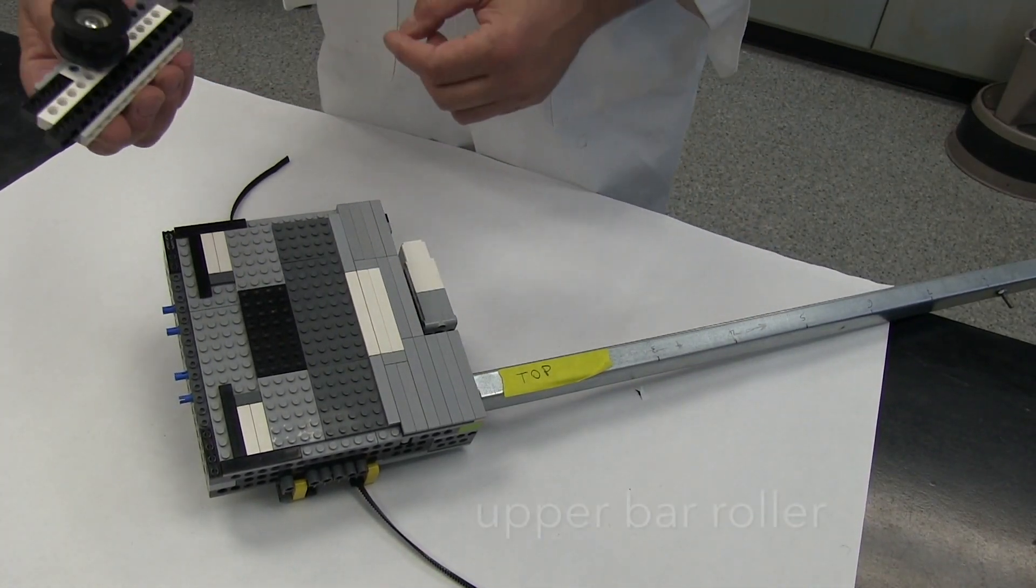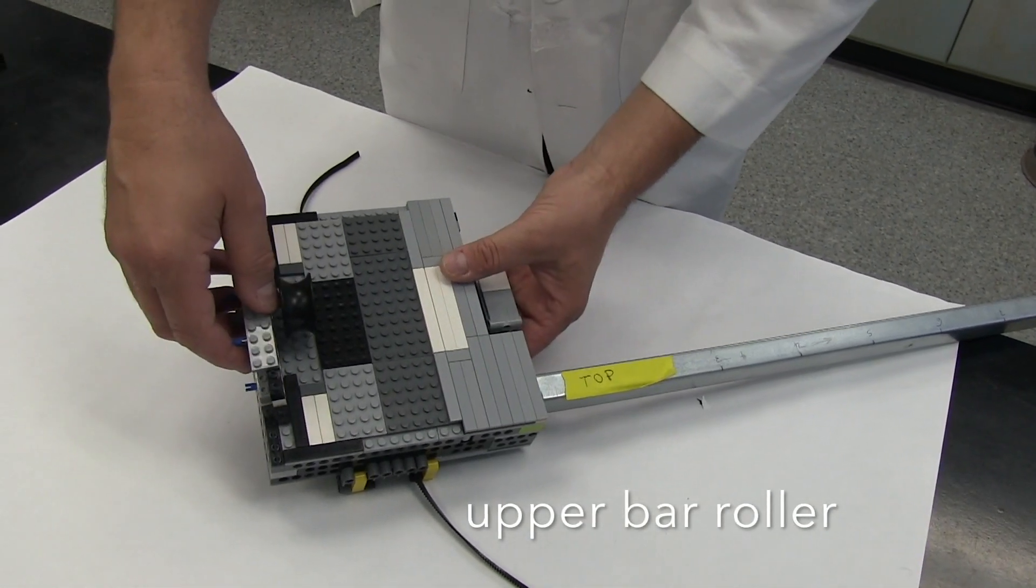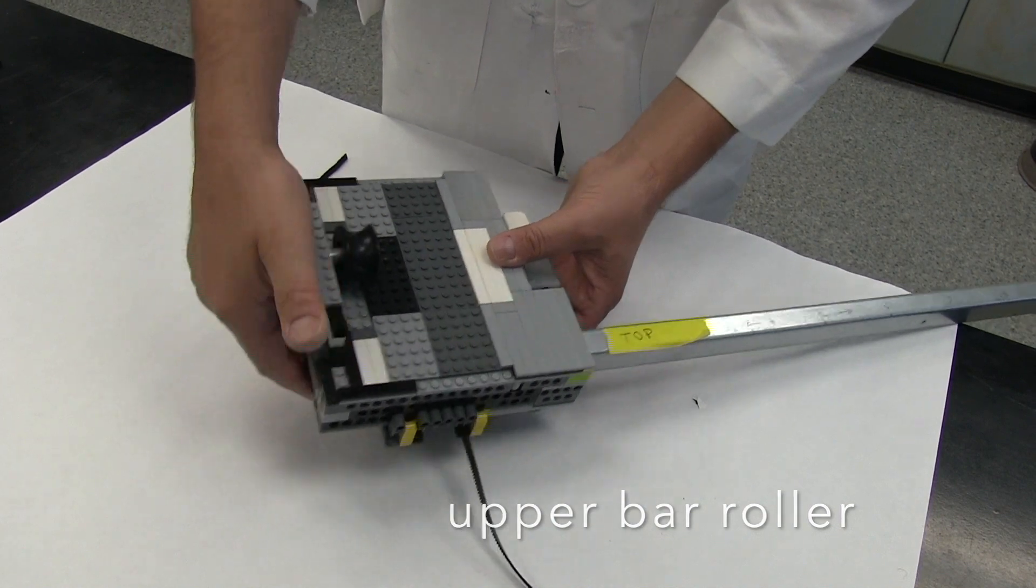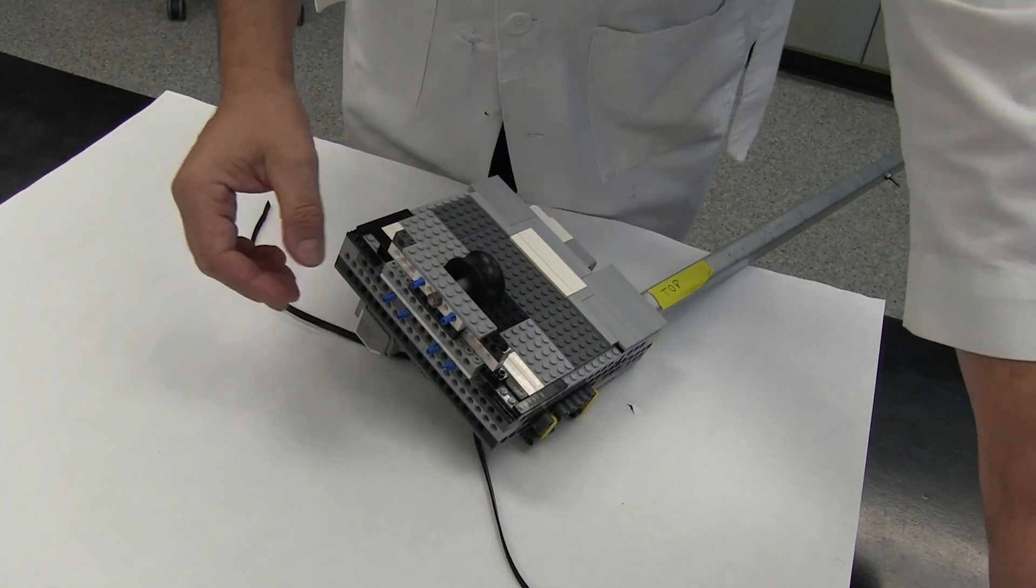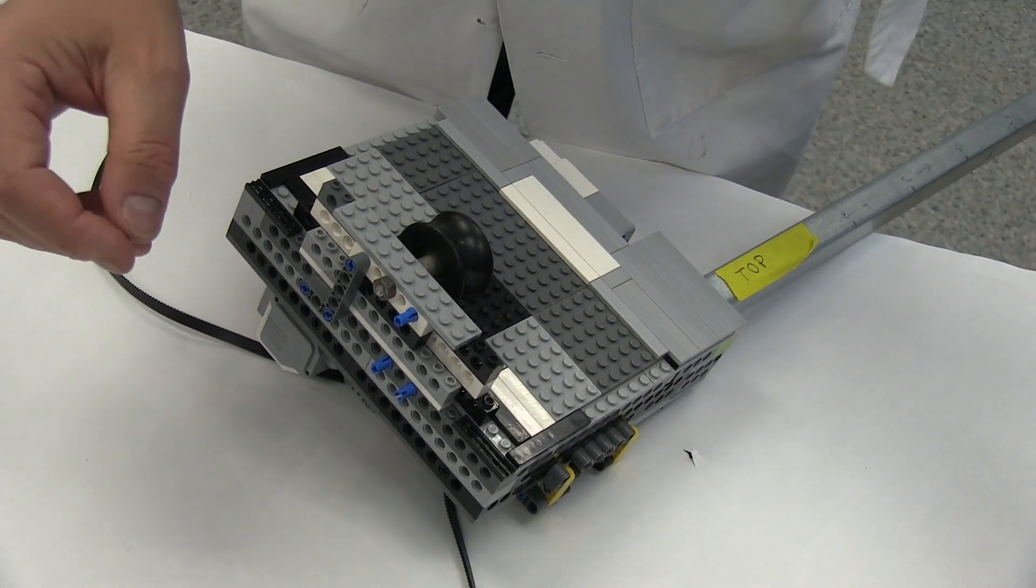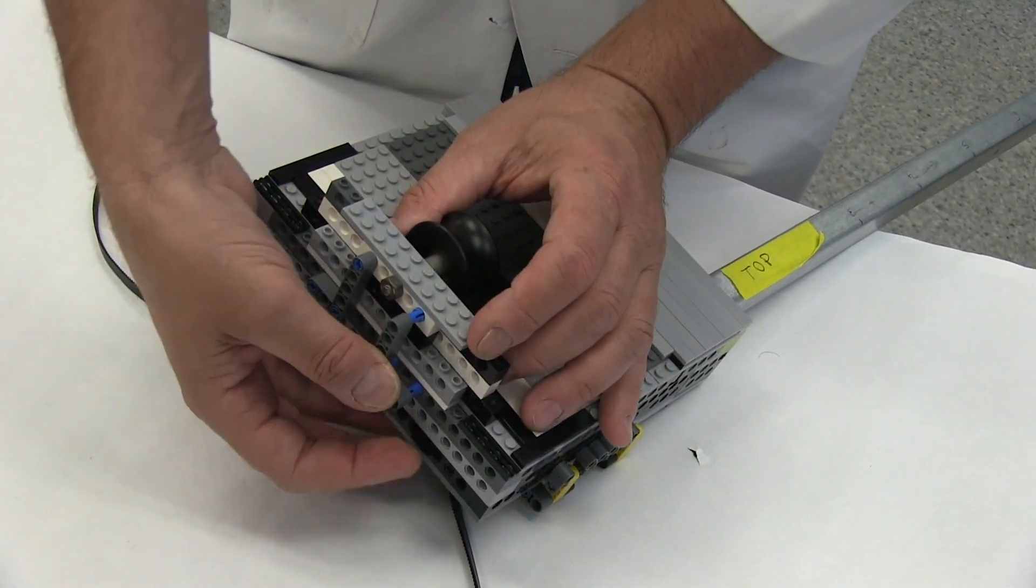In this next step, we will install the roller for the upper bar. This will enable smooth sliding motion of the robotic arm from left to right over the whole base of the fraction collector where the collecting bottles will be placed.